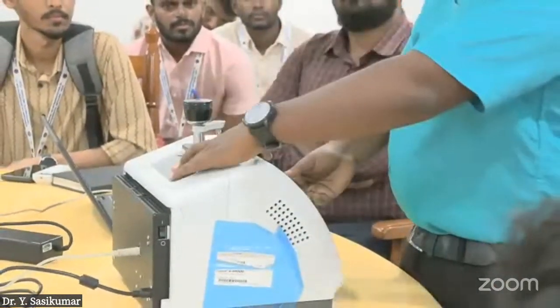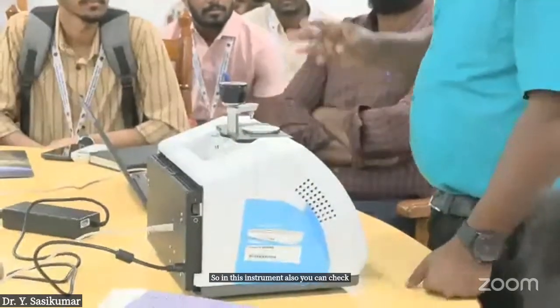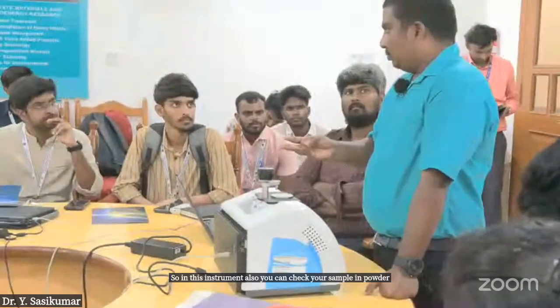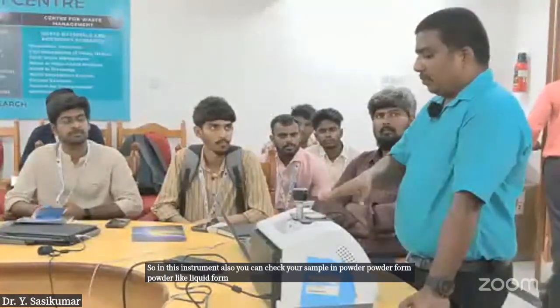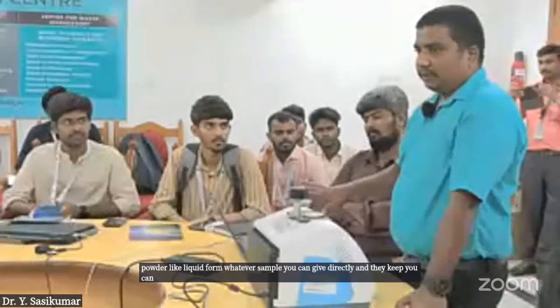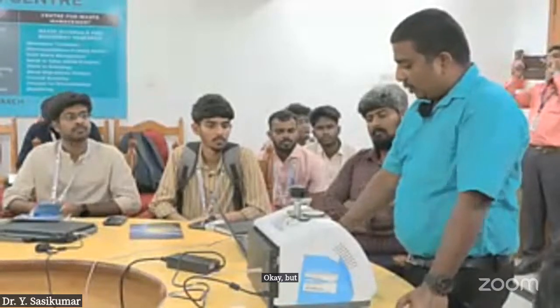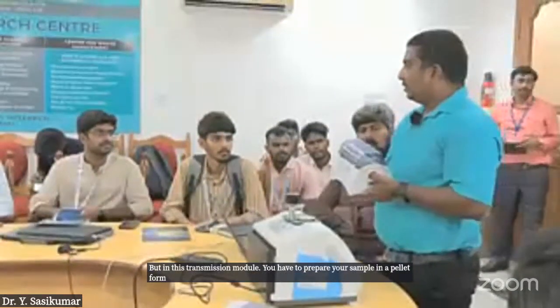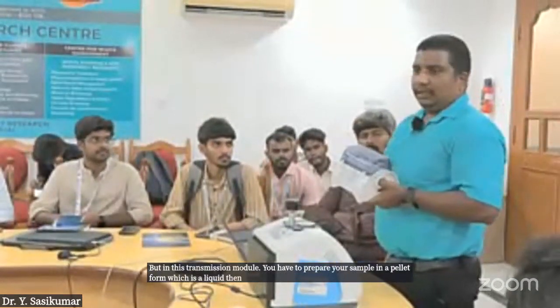In this instrument you can check your sample in powder form or liquid form, whatever sample you can keep directly and get your spectra. But in the transmission module, you have to prepare your sample in pellet form. If it is a liquid, there is a separate liquid cell.